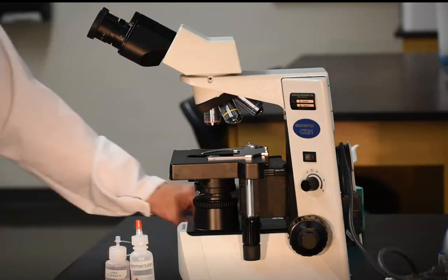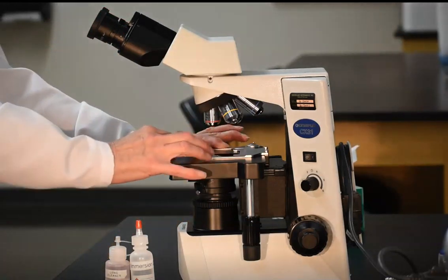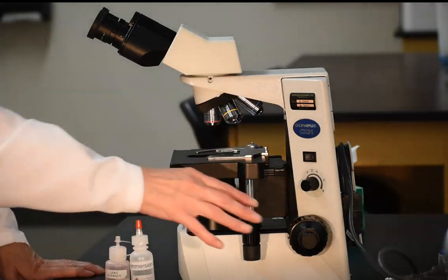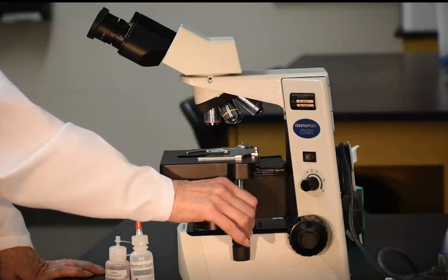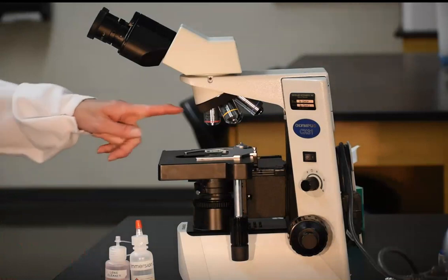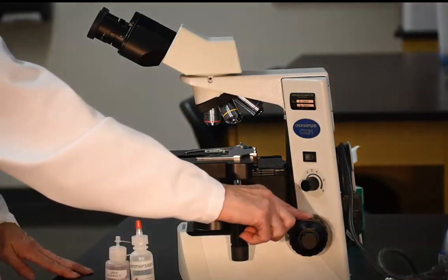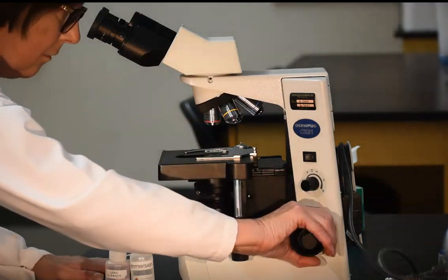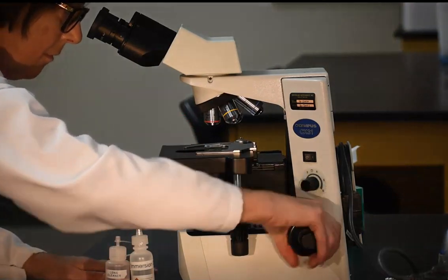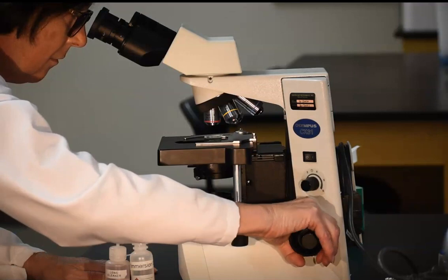Once the oculars are adjusted for your width, place a slide on the lowered stage and secure it with a mechanical stage clip. Check that the light beam is coming through the center of the specimen. If it isn't, you will use the stage controls to center the slide. To begin to focus, we always start with the scanning objective lens, and we use the coarse focus knob to focus. The lower magnification lenses have a large working distance and a large depth of focus. This enables us to find the object on the slide without risking damage to the objectives.